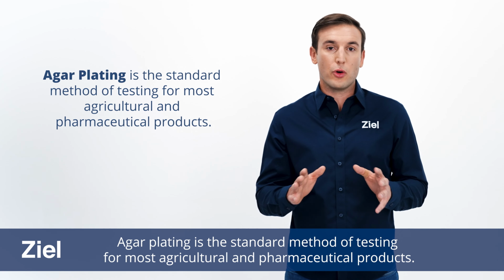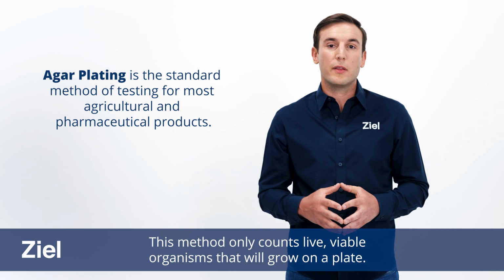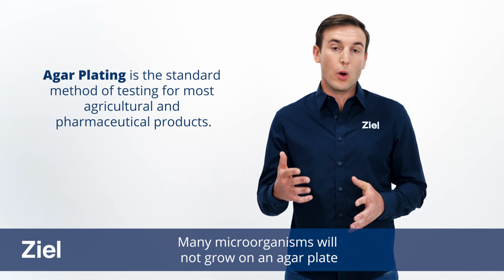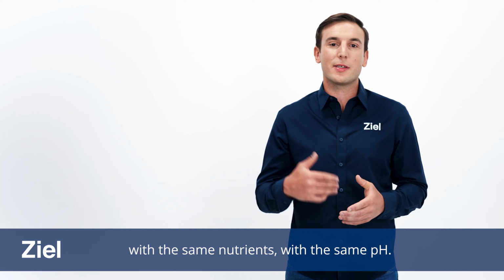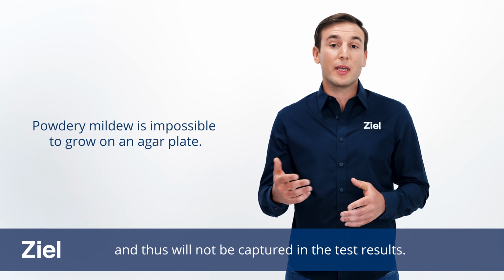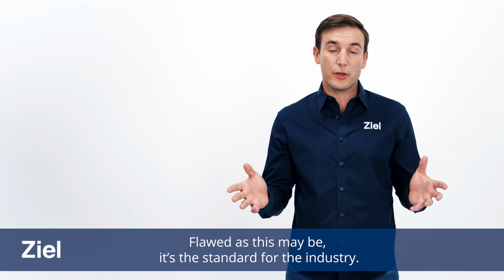Agar plating is the standard method of testing for most agricultural and pharmaceutical products. This method only counts live, viable organisms that will grow on a plate. Many microorganisms will not grow on an agar plate because it isn't suitable to promote growth. It's a bit like expecting every plant on Earth to grow in the same soil with the same nutrients with the same pH. For instance, powdery mildew is notoriously impossible to grow on an agar plate and thus will not be captured in the test results. Flawed as this may be, it's the standard for the industry.